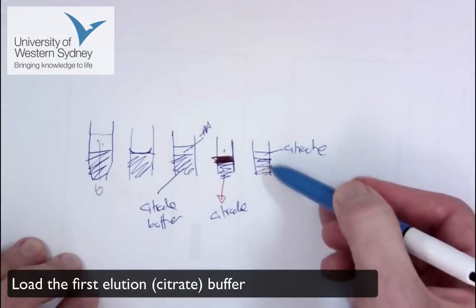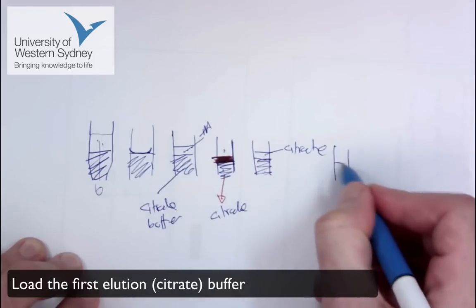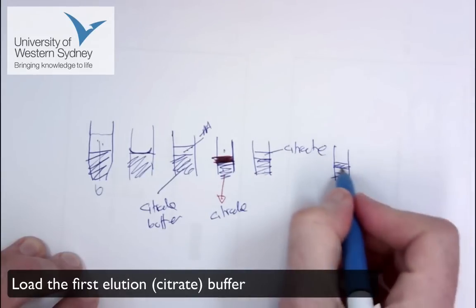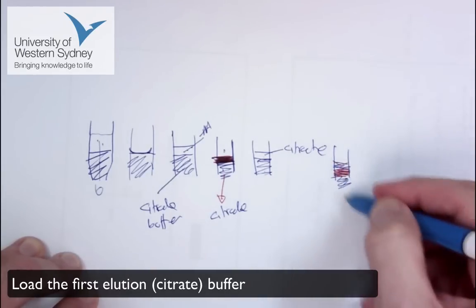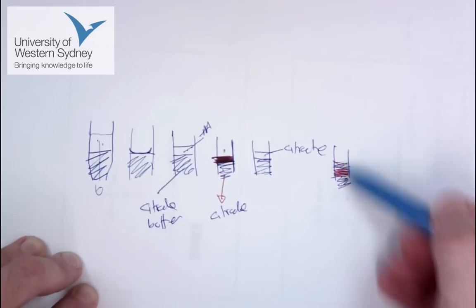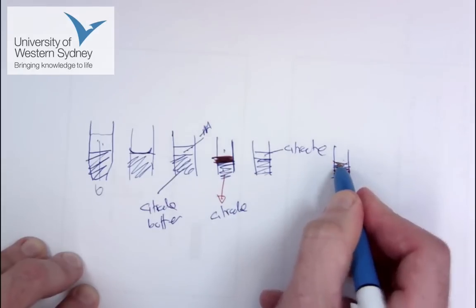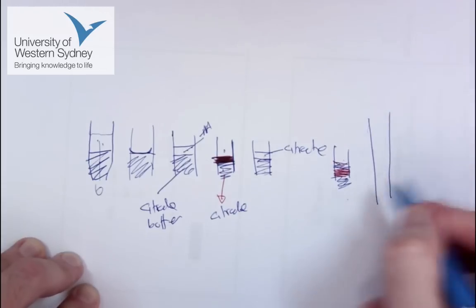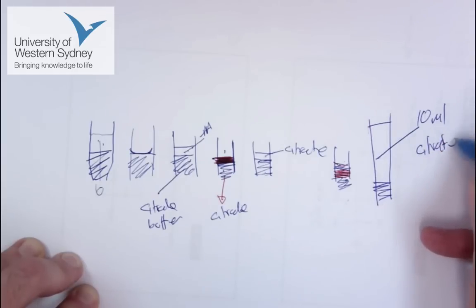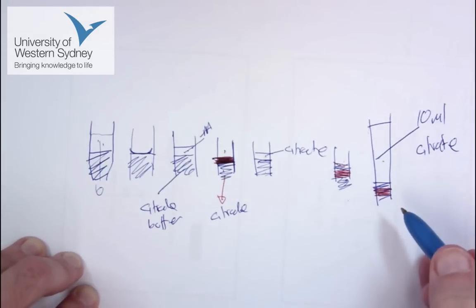Now, the volume of this citrate is smaller than the capacity of the column. Yeah, and that's important because when you run that citrate now into the column, your amino acid now is loaded into the column proper, okay? So it's important to add just a mil here, or whatever it says, and then to run that through, because it pushes the amino acid into the column, so there's no amino acid now at the top of the meniscus, okay? And now when you take that long column and you load it up with mils of citrate, there's no mixing of the citrate buffer with the amino acid that's in the column.